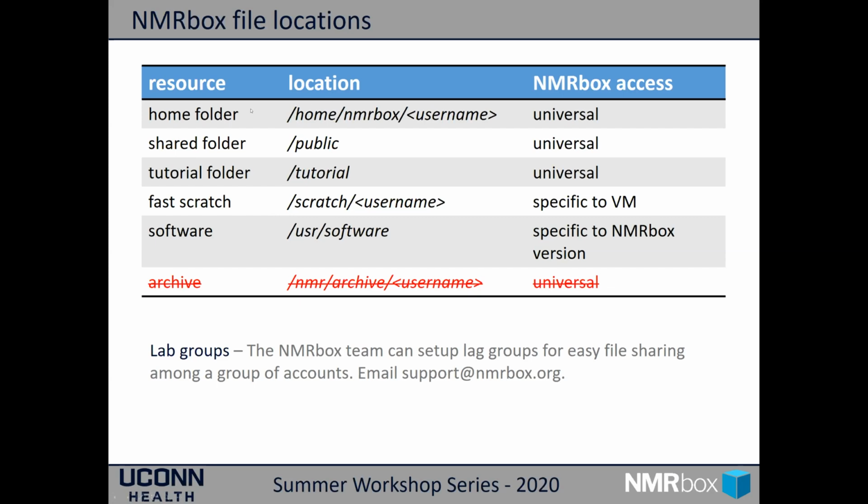It is important that you copy the data back, because we treat the scratch disk as a true scratch disk, and after a few days the data will be purged, because we need to keep that scratch disk open for the next user. We can't have it fill up with data. And then software, user software is where all the software is located. We've already talked about that.